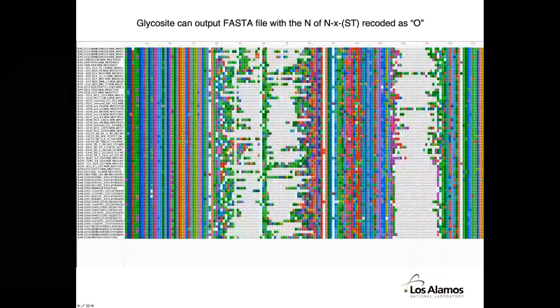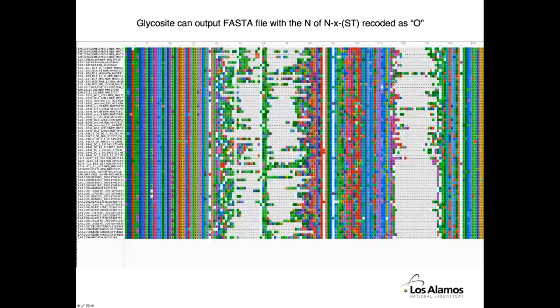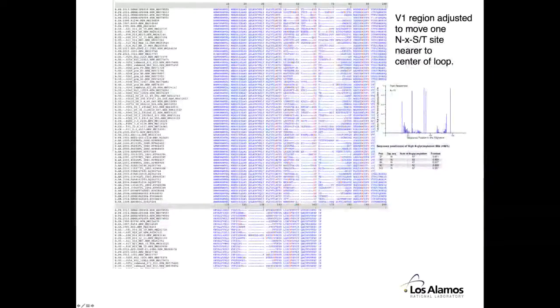So depending on how you align your glycosylation sites, you can get slightly different outputs here. But in general, we have a lot of sites that just kind of shift around, and they're not truly homologous. So for phylogeny, you don't want to necessarily align these. You're better off to strip this whole region out of your alignment for getting an accurate phylogeny.